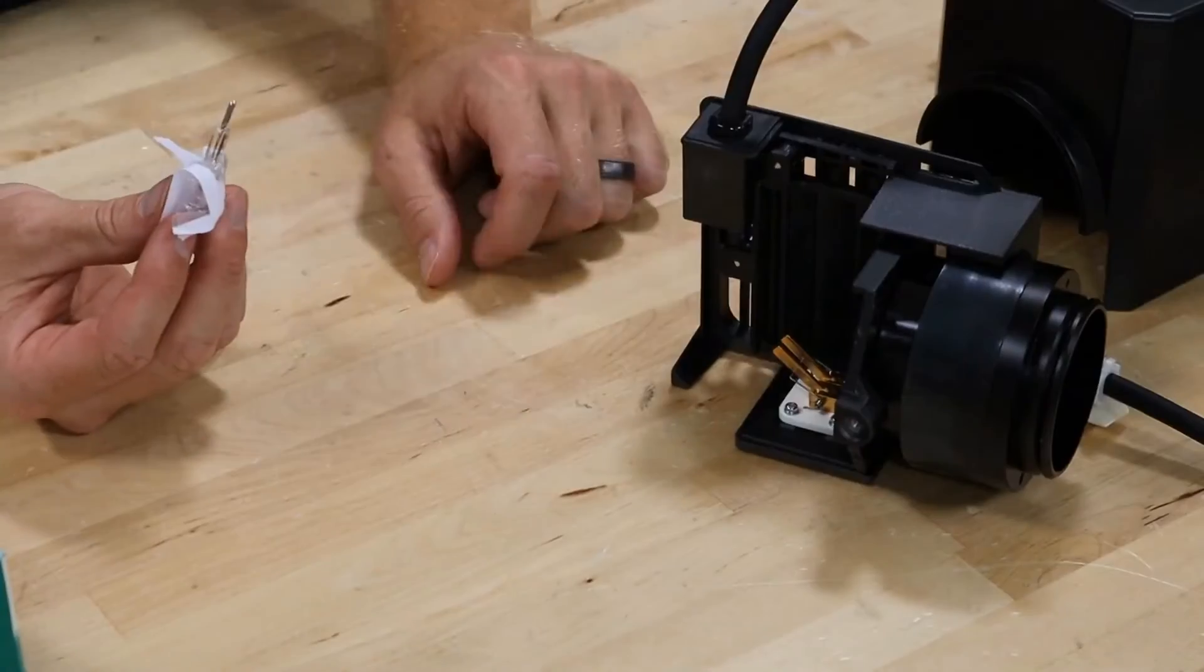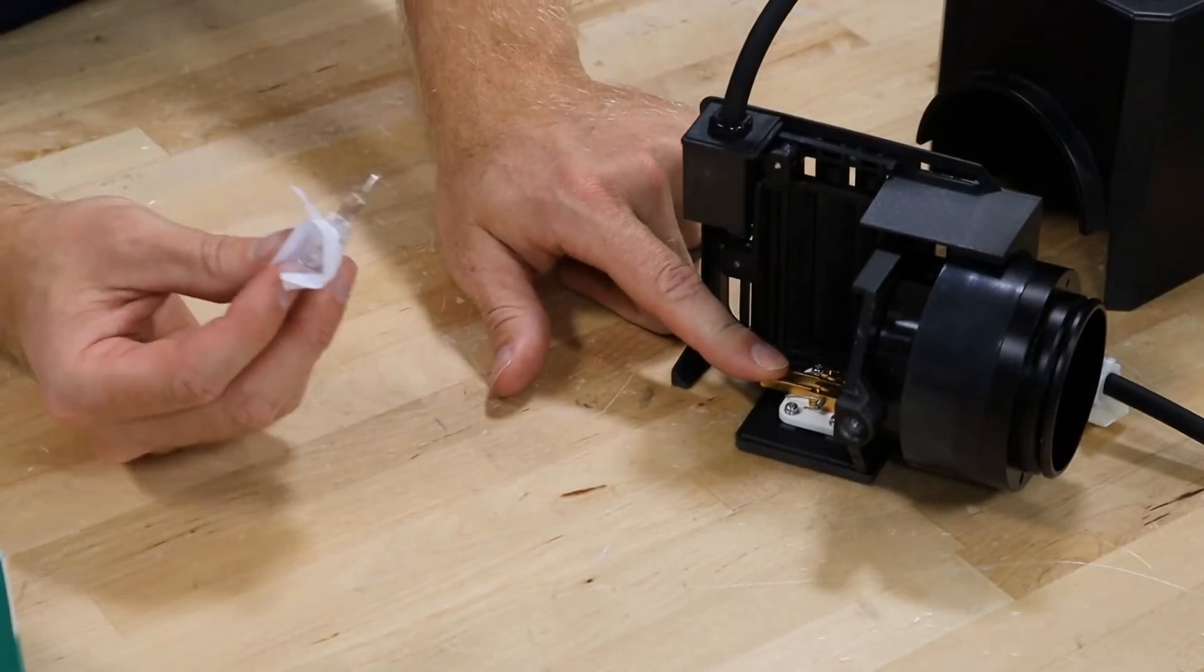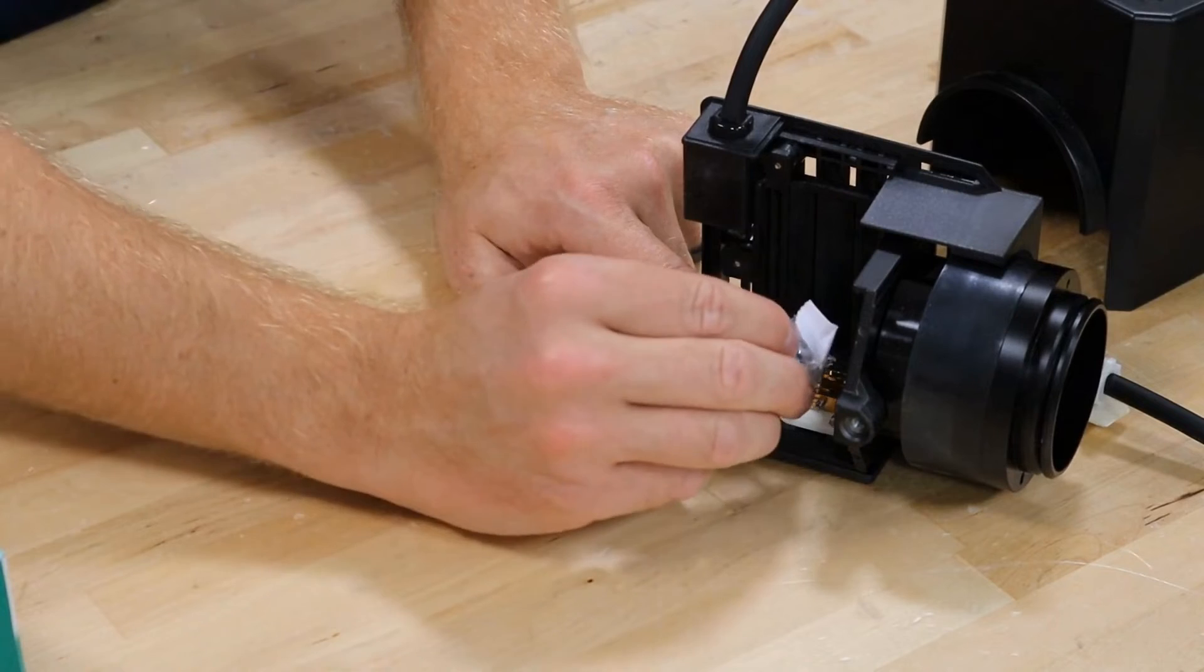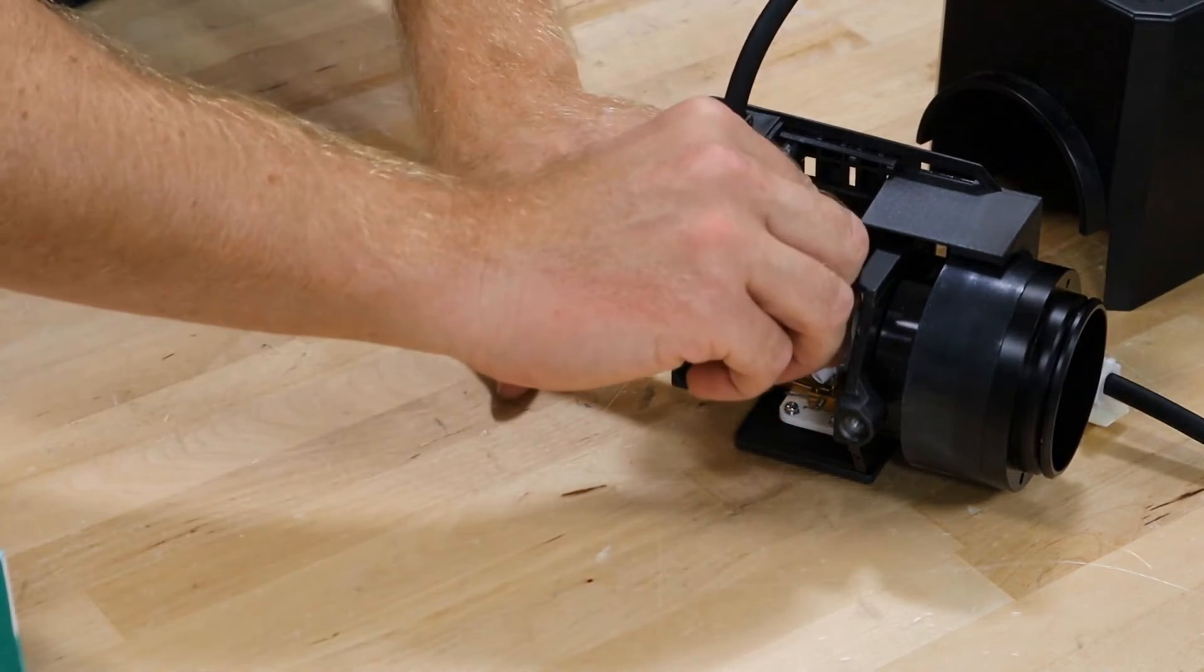Once you've got the bulb out, simply depress the two bronze looking contacts, slide the bulb into place, and then remove the plastic wrapping while the bulb is clamped in place by the contacts.